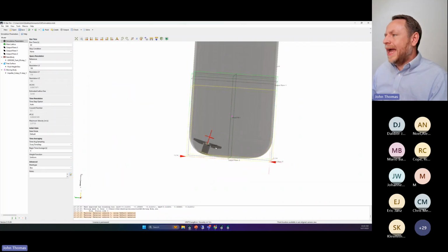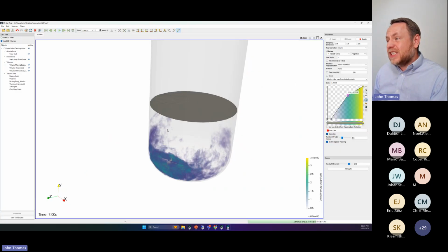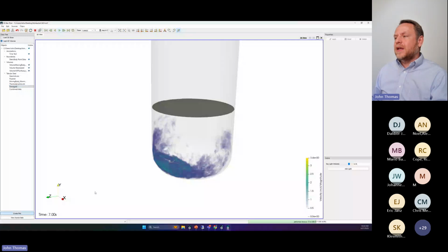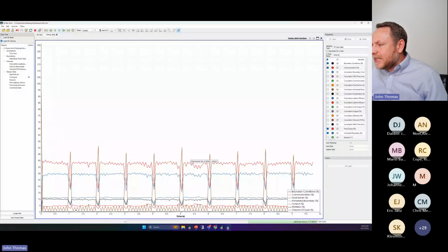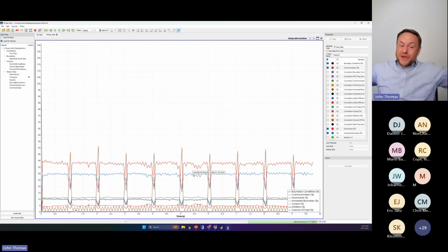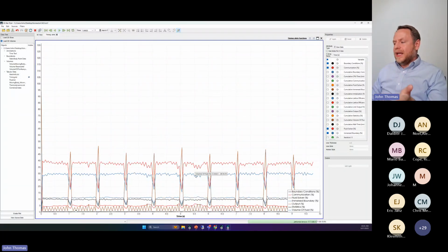If I drop this time step by maybe 20%, that'll snap down to just a few percent, which would be fine. I'm also forecasting that I don't need all of this free surface dynamic, and there's an expense here. If I look at the timing, where I'm spending my time in this code: I'm running pretty well, but I'm doing 38% of my time doing Navier-Stokes and 30% of my time doing that VOF free surface. That's a lot of tax for pretty underwhelming physics. It's just wiggling around, and maybe at best I get a little vortex. I can make this code run like 30% faster if I just turn off that free surface.